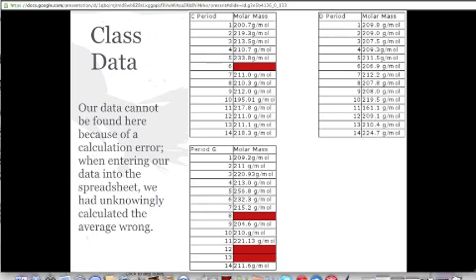What happened here was, the day we had to submit our information into the spreadsheet, we made a calculation error in trial 1, and the molar mass for trial 1 was calculated to be around 207.5, which is definitely higher than the 206.9. When we redid our calculations, we found out that there was this error, and although the molar mass is 209.0 grams per mole in the class data, what we actually should have gotten is displayed on the previous slide data table as 208.4 grams per mole.